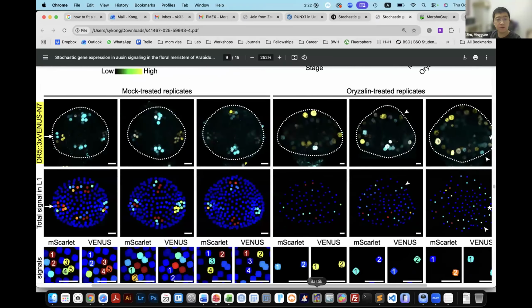Okay, yeah, thank you for the answer. And here I think there is a more practical question for both of our panelists. Some people complain that it seems hard to explore the full function of MorphoGraphX, and sometimes they cannot find a very useful protocol, or a detailed description of how to do the analysis they want. So you have used MorphoGraphX a lot. Do you identify any useful resources for that? Or do you know any way to help the community become more familiar with MorphoGraphX and do whatever they want to do?